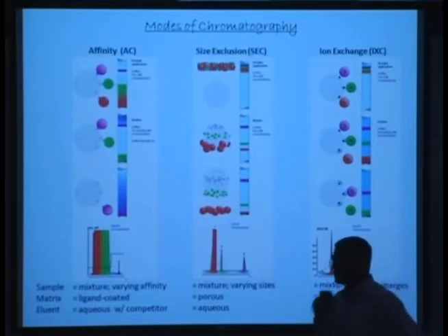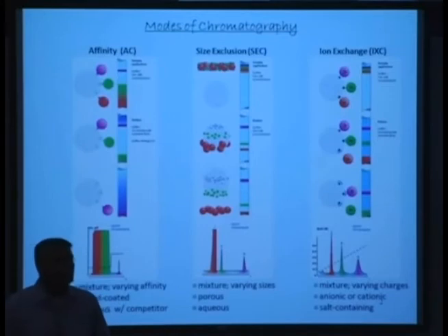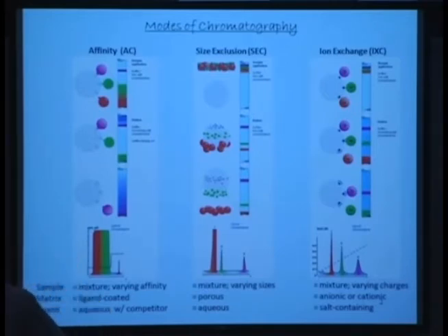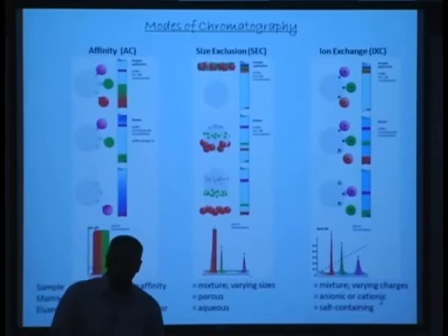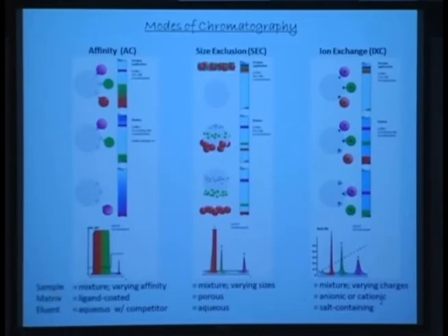Once again, simple things that you know of, but I want you to think. By the way, we are going to do chromatography today. So, why is desalting a problem? It precipitates. If you reach that high concentration, sure, it precipitates. Let's say that you have, all right, I'll give you a clue. I'll give you an example.